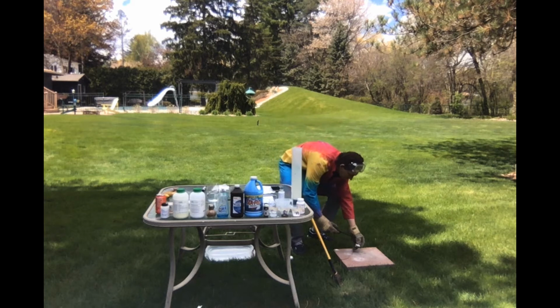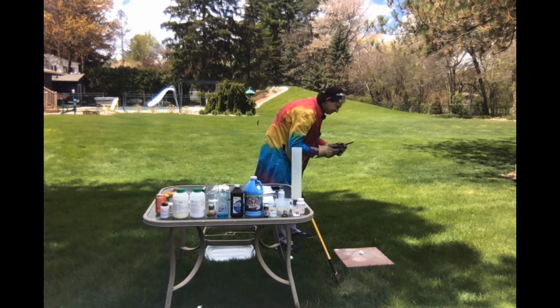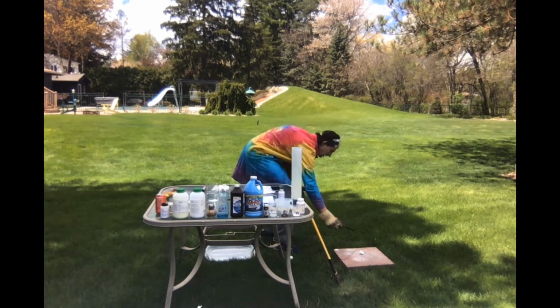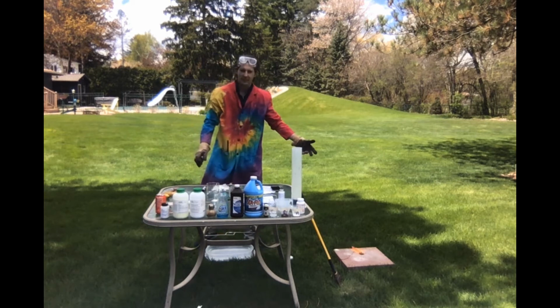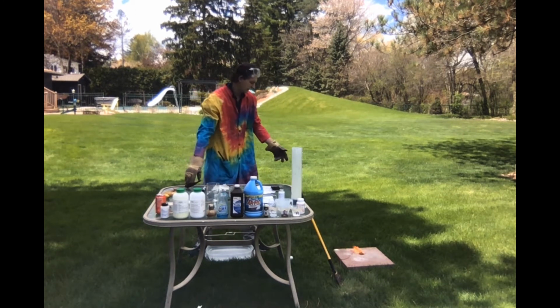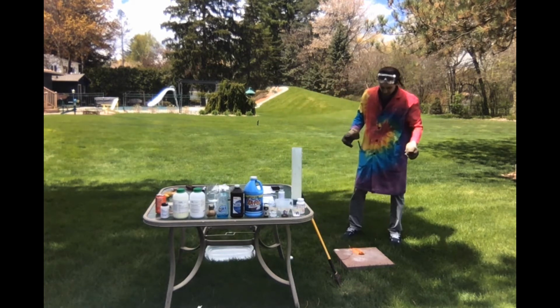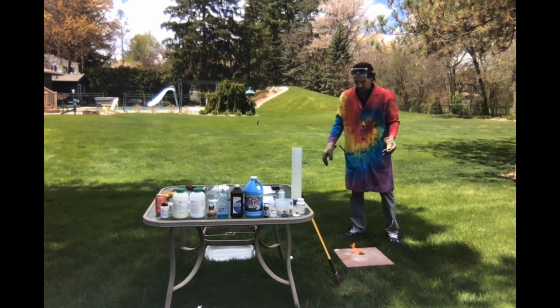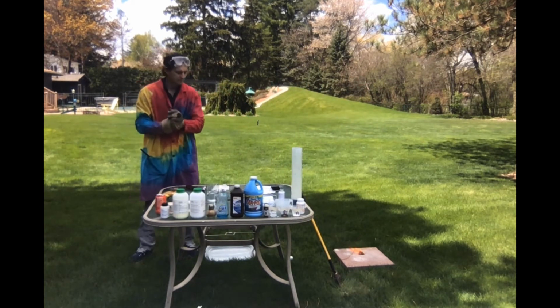Put it down here. And that is a chemical change right there, okay? You can see the cotton ball burning. I might let it burn for a little bit, and then we're good to go, okay? Once it's all burned out, we'll move on.